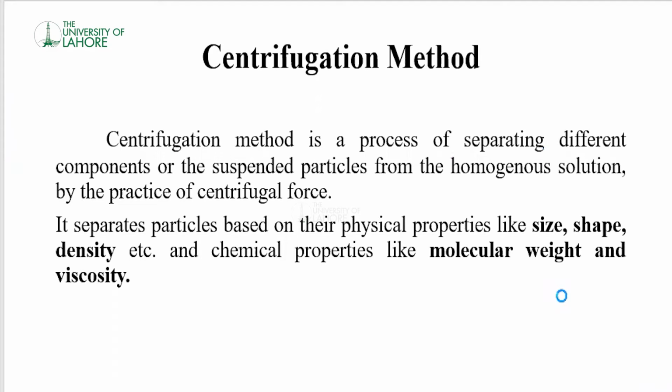Particles are separated on the basis of their chemical and physical properties. If we look at the physical properties, we have to consider the density, size, and shape. On the other side, if we look at the chemical properties, we have to consider molecular weight and viscosity.